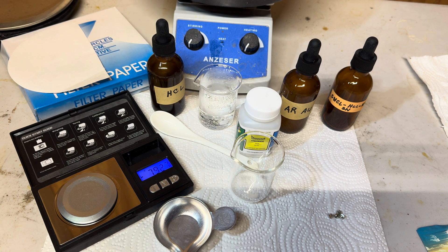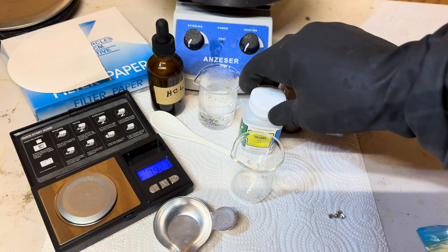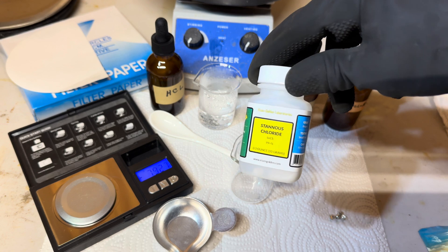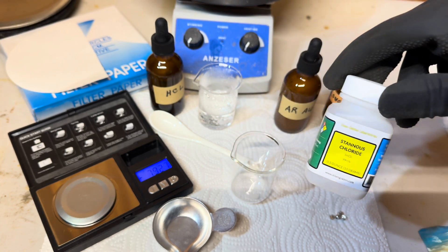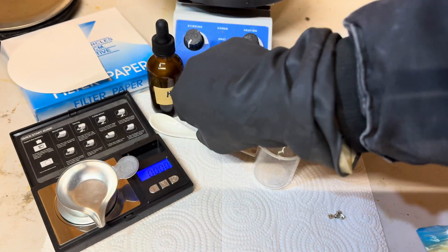Here are the ingredients and materials that we will use to make our stannous chloride. We have our stannous chloride crystals and four pure tin shots, distilled water, hydrochloric acid at 31.4%. We have a dropper bottle to store our stannous chloride in, some aqua regia with gold to test our stannous chloride, filter paper, and a scale to weigh out our materials.